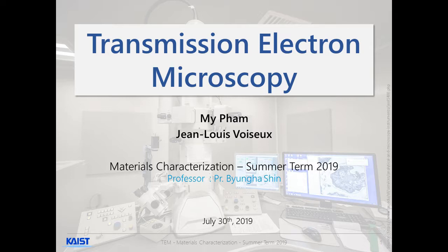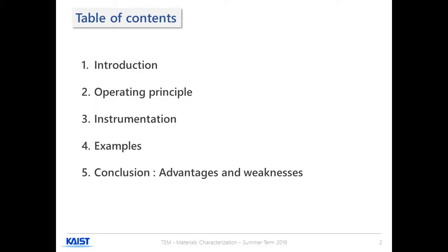Welcome to this presentation about transmission electron microscopy, most commonly abbreviated as TEM. We will first start by a brief introduction about electron microscopy and the basic working principle of a TEM. Then we will move on to its operating modes as well as their underlying principles.